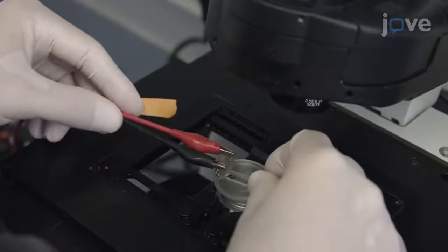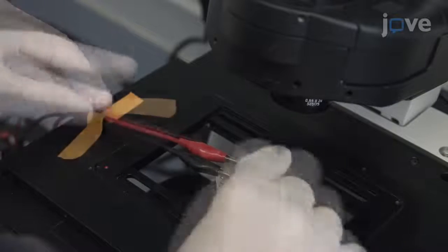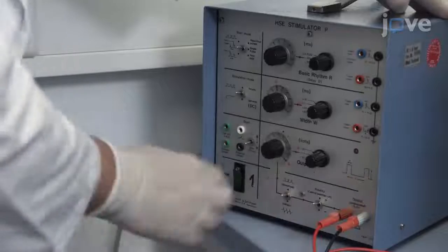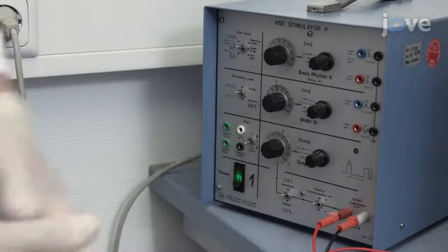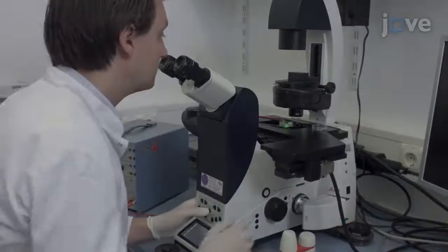If electrical pacing is required, install pacing electrodes in the imaging chamber and connect the electrodes to a stimulus generator. Bring the cells into focus.